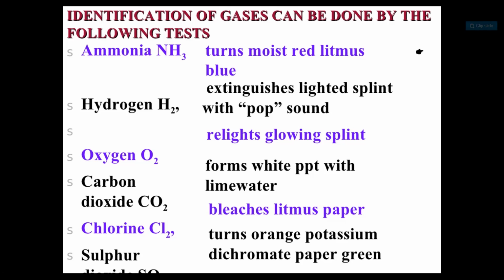So the second test is the hydrogen gas test.